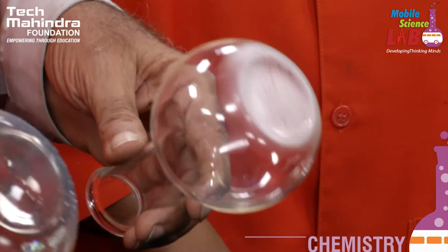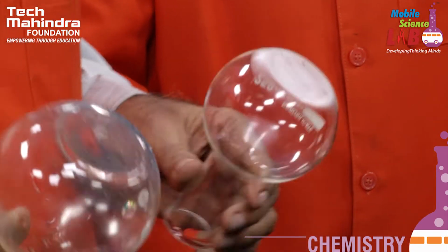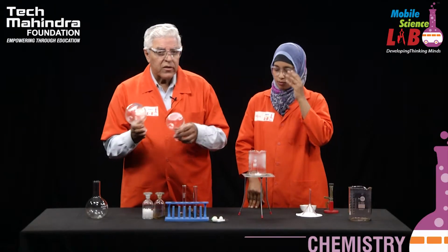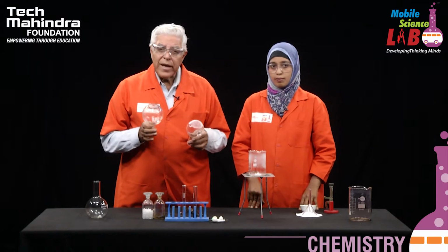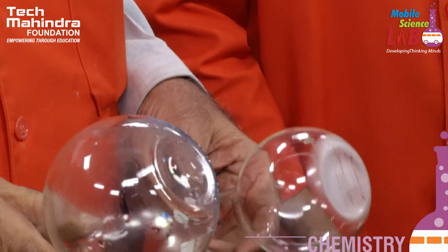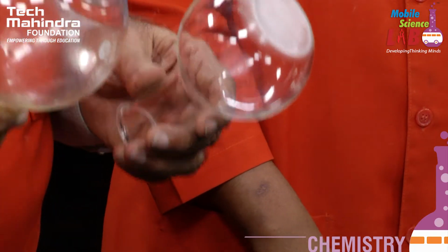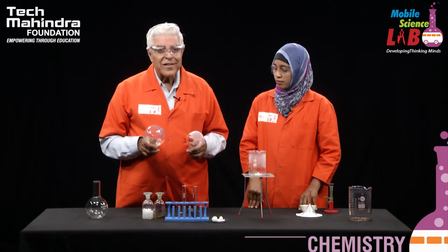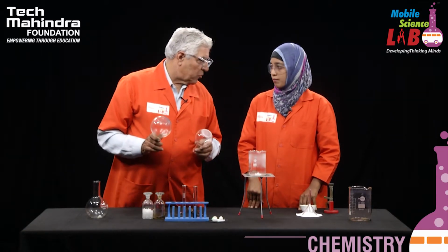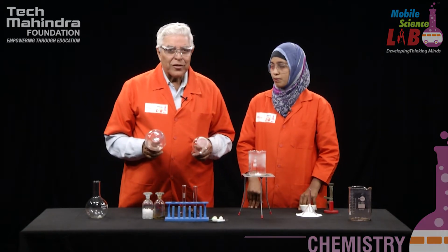And both of these exhibit what? Sublimation. So sublimation is a process in which we have gone directly from the solid state to the vapor state. Another interesting chemical that does that is solid carbon dioxide or dry ice. So I hope, students, you have now understood what sublimation is, and this is an experiment which you have to do under teacher supervision. Of course. So I hope you enjoyed it, and thank you all very much for this.